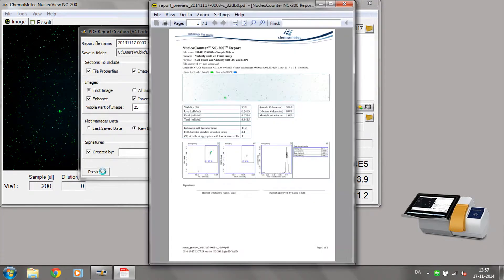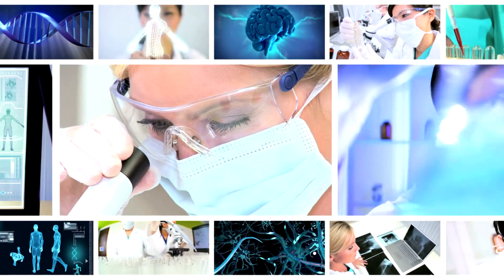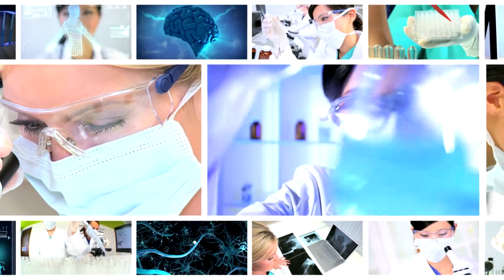The NC200 is 21 CFR Part 11 ready and with the ability to perform IQ, OQ, PQ, it is ideal for regulated environments.